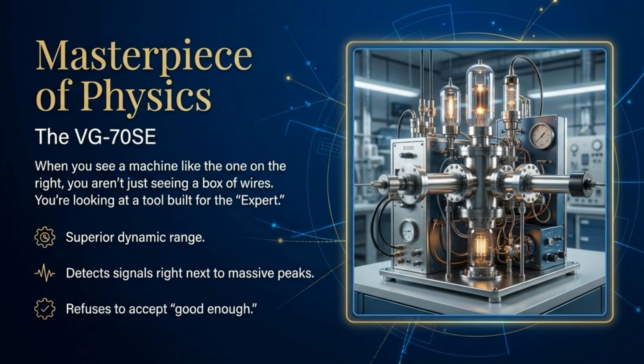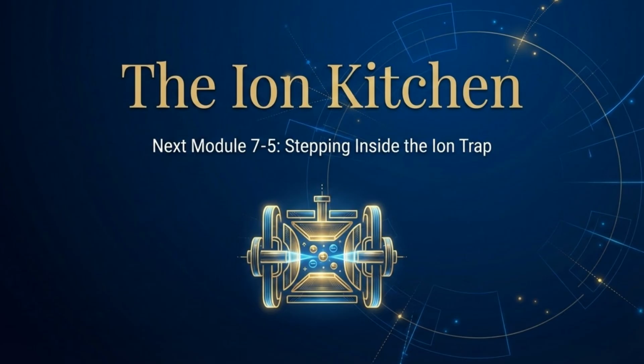Don't just see a box of wires. See a tool built for the expert who refuses to accept good enough and demands the absolute truth of atomic composition. If you take away only one thing today, let it be this golden sentence. You no longer just see a mass spec result. You understand the why behind the resolution.